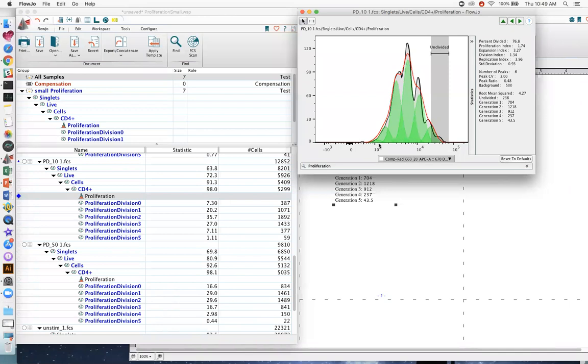And then way down here, generation 3 or 4, you start to see peaks. That means that the first couple of generations have passed by the time you have sampled the data. And in that case, you could have 0. Now the model sometimes does okay, the other times it doesn't do so well in those instances.